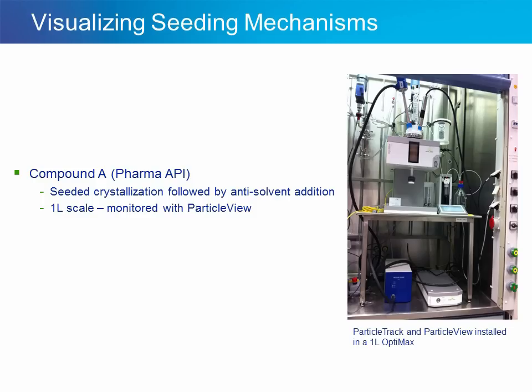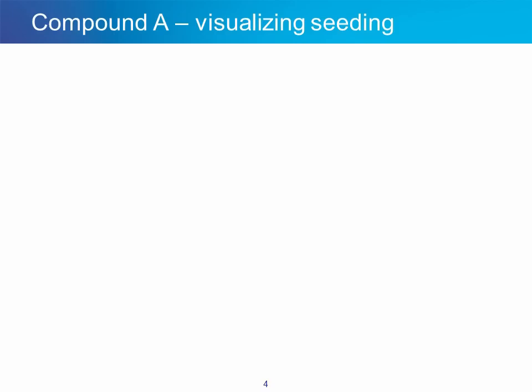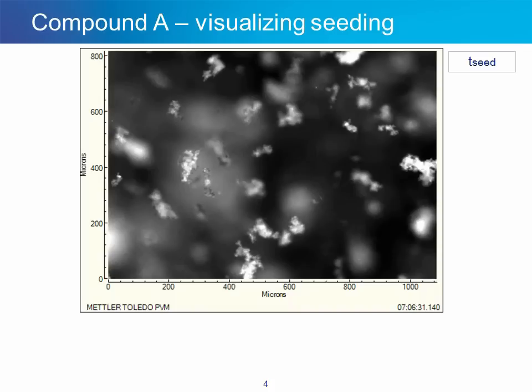In our first example, compound A is crystallized at a 1-liter scale in an OptiMax reactor, and ParticleView with PVM technology is used to visualize the crystallization process using real-time microscopy. This is a seeded crystallization followed by an anti-solvent addition. Here we see one of our first real-time microscopy images collected using ParticleView, and we can actually see what the seed looks like from a microscopic perspective directly in the process.